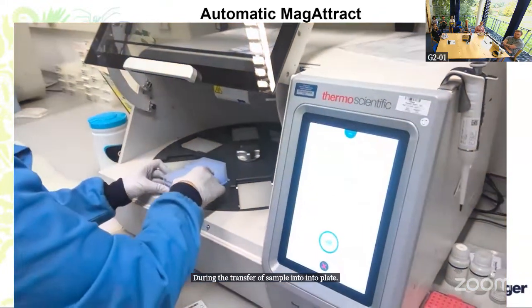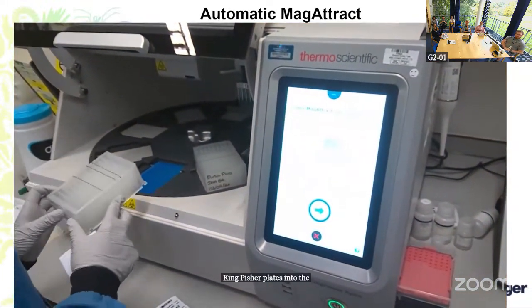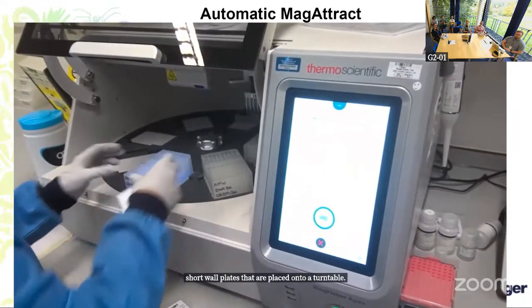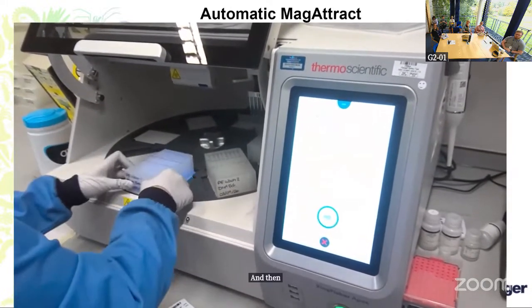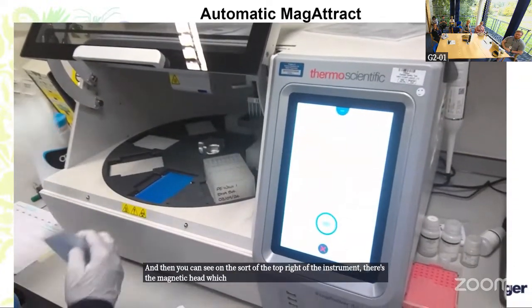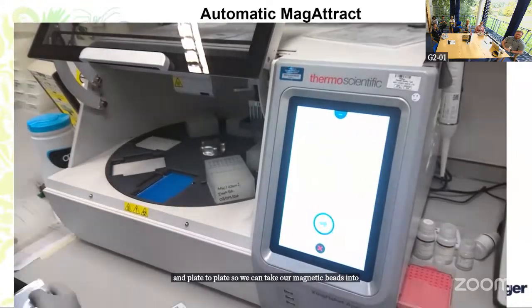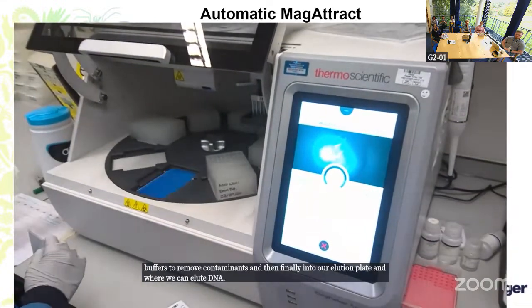And so here we are just loading our Kingfisher plates into the Kingfisher. The Kingfisher works with deep well or short well plates that are placed onto a turntable and then scanned into the instrument. You can see on the top right of the instrument there's the magnetic head, which transfers magnetic particles from plate to plate. So we can take our magnetic beads into the different wash buffers to remove contaminants, and then finally into our elution plate, where we can elute DNA in our elution buffer.